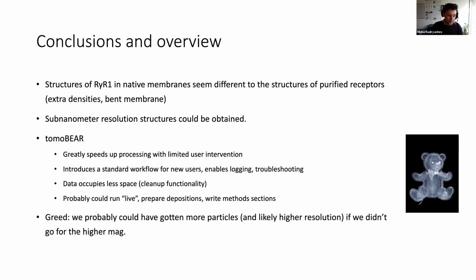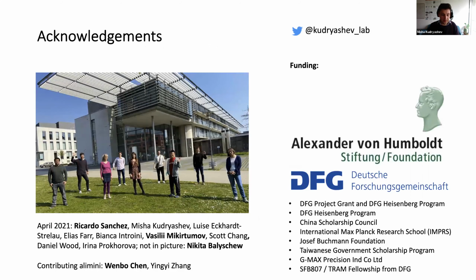And a little greed that I have to admit is that we probably would have gotten more particles if we didn't go for very high magnification, because higher magnification results in a lower field of view. So yeah, I think this is on the experimental design side. So sometimes me and other people maybe should consider not being so greedy for the mag, especially when it gets to tomography.